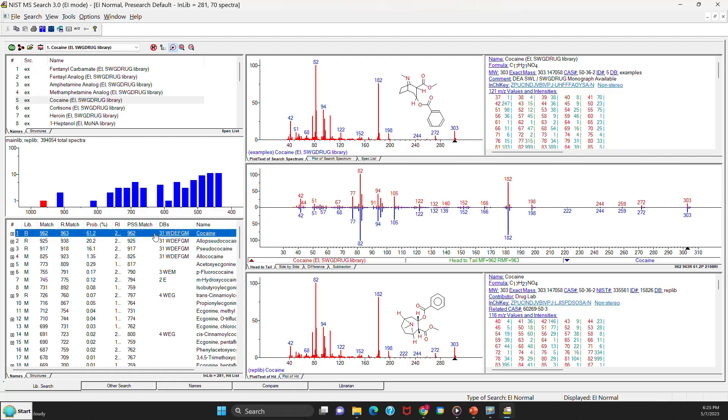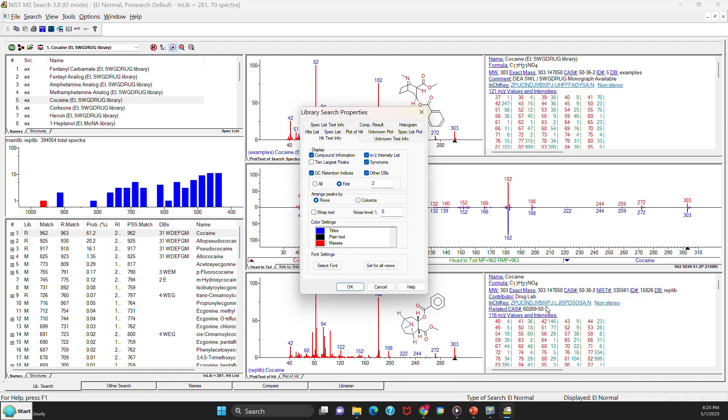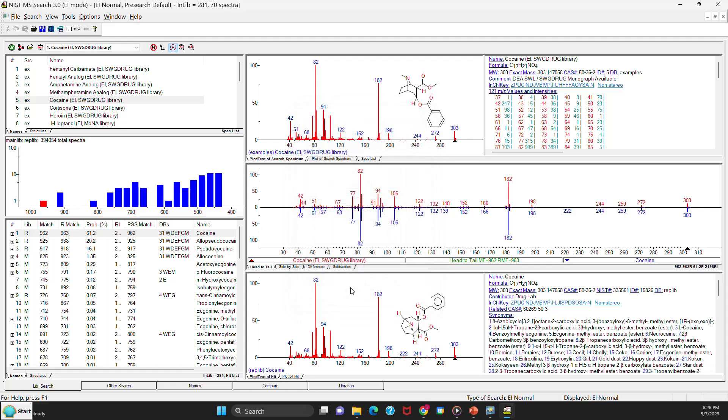What I like to do is right click on the bottom and change the properties. I don't find it very useful to use up my space on my screen for the intensity list. So I'm going to get rid of that. I like to wrap the text around so I can see things that might go off the screen on the right. And I'll say okay. And now I get the display on the bottom.